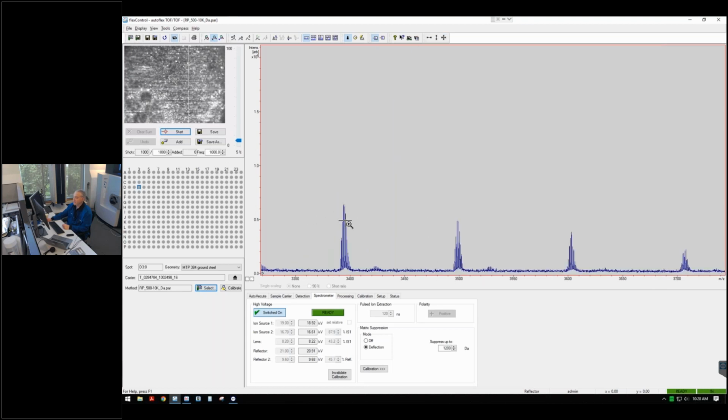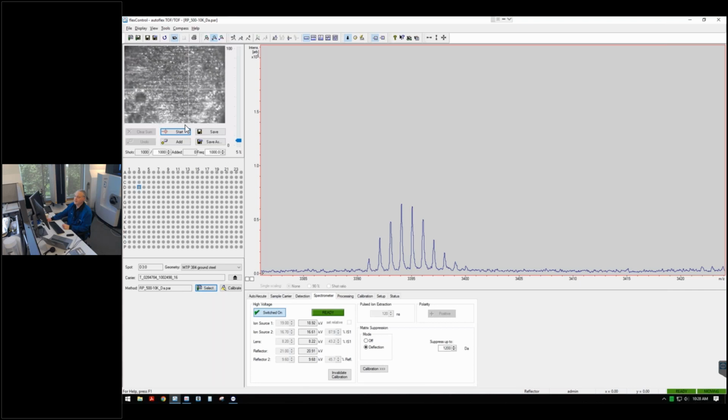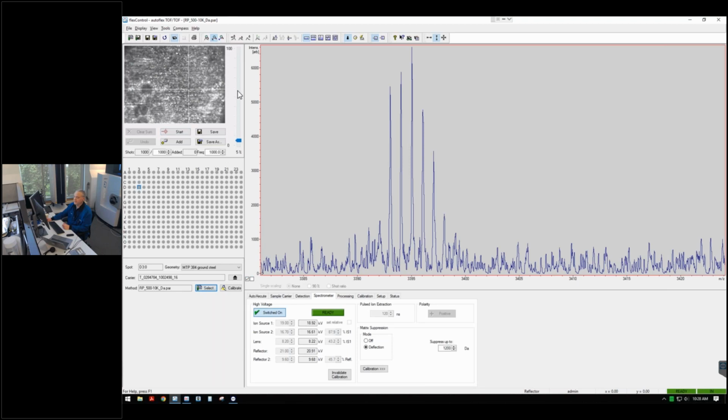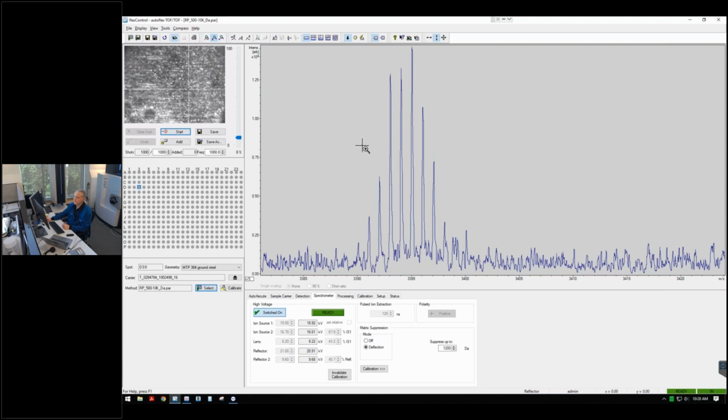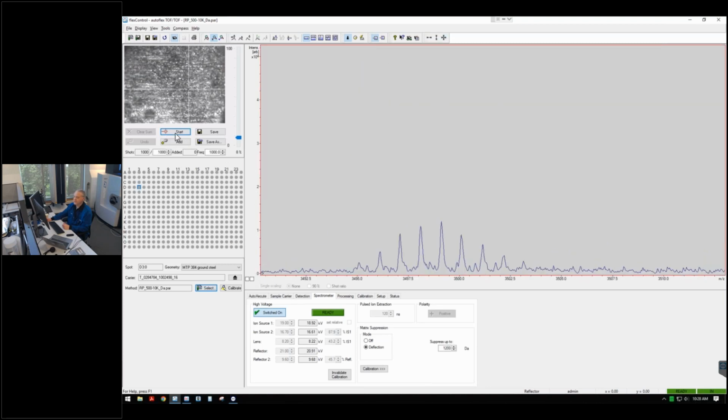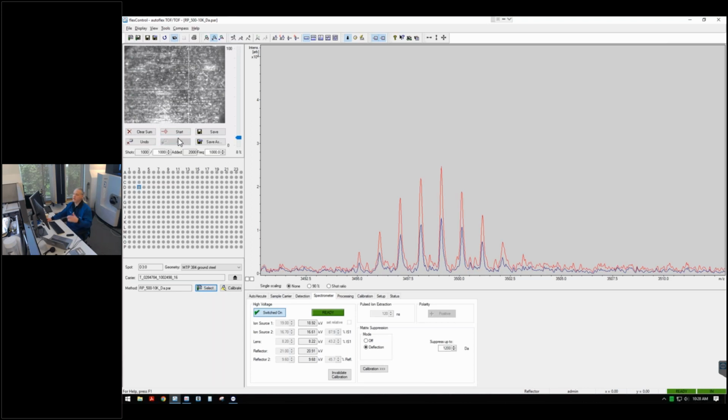We're going to go to the higher molecular weight side and look at the data as we collect it, making sure that we're not using too much laser power where we're destroying the analyte, but we need enough to get decent signal. So once we're happy with the resolution and the signal to noise, we could start adding these shots to the sum buffer. So what we're going to do is sum a bunch of shots, hopefully reducing noise while increasing signal.